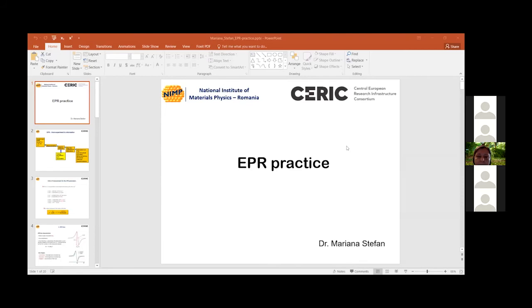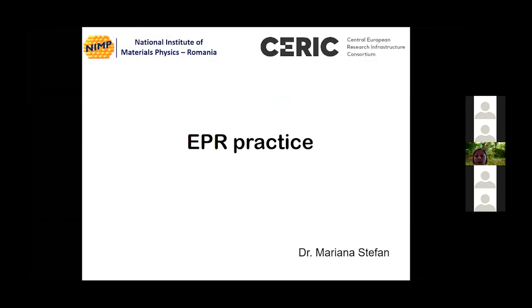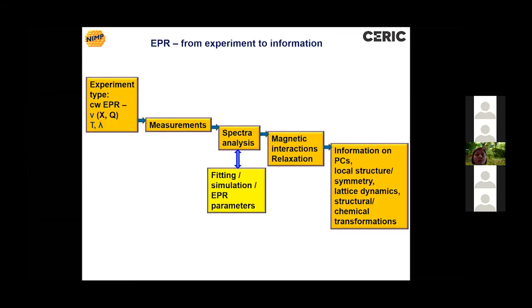In this part, I will present details and illustrations to the concept introduced in the theory course in the first EPR course. With inspiration from Professor Plavic, I have drawn a flow of an EPR study from experiment to information.